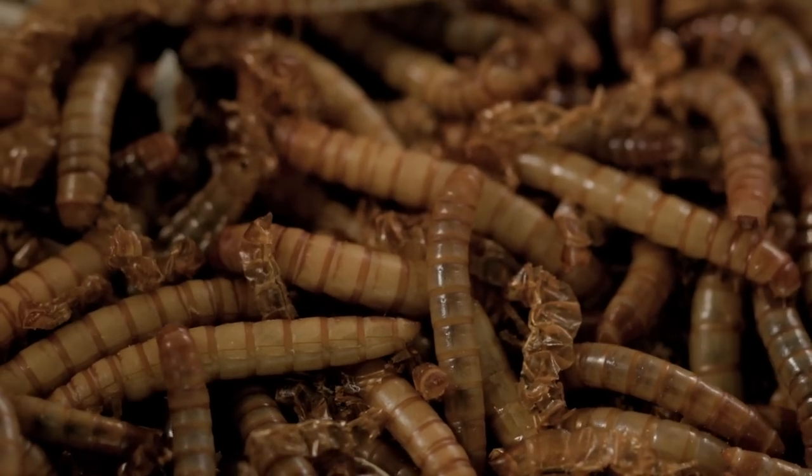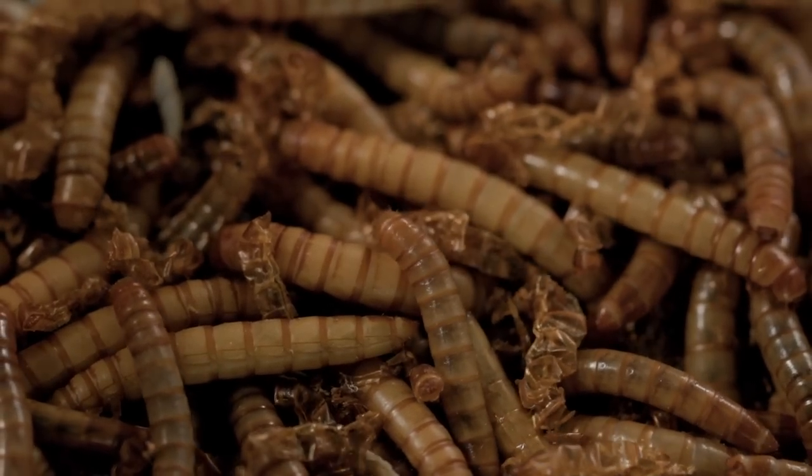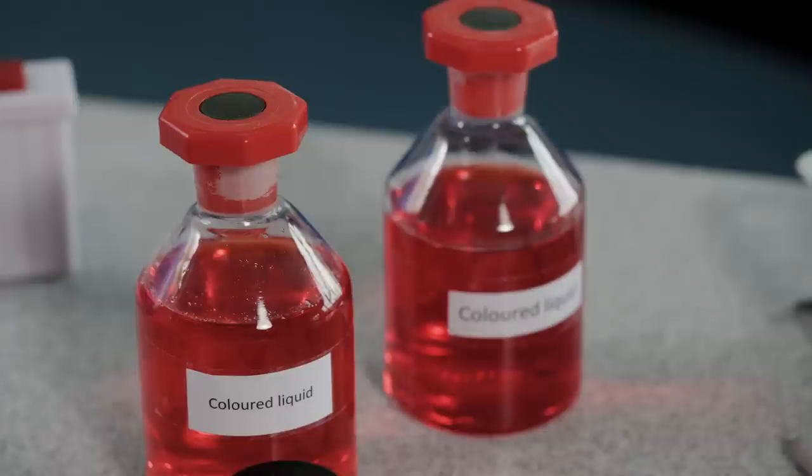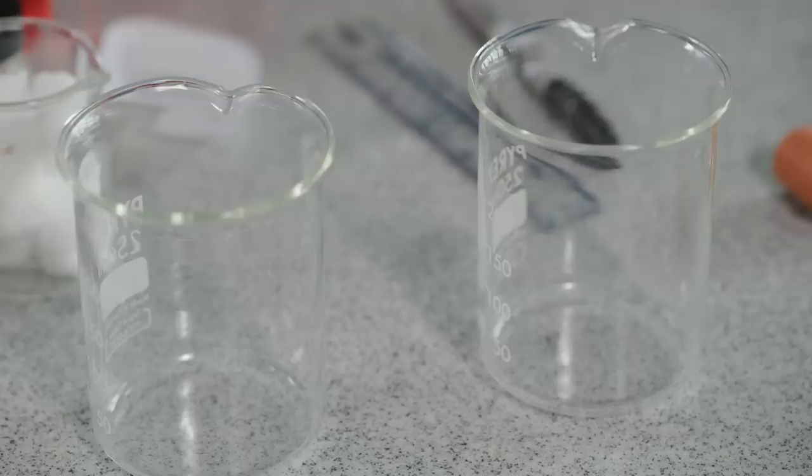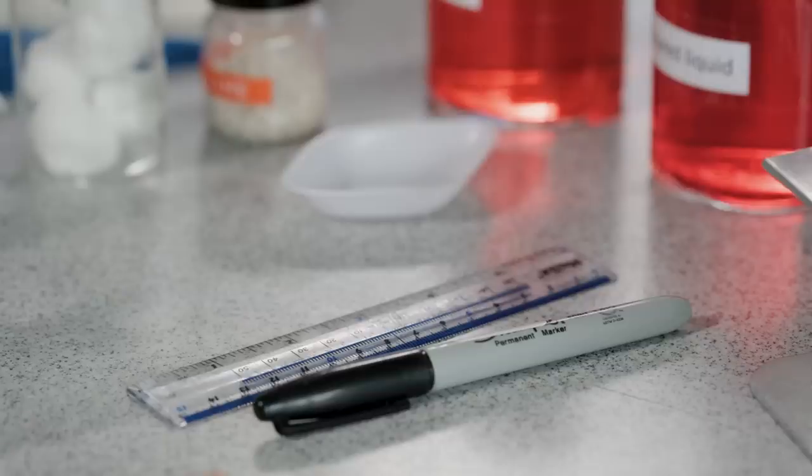Small organisms—we are using maggots—colored liquid, two beakers, forceps, millimeter scale ruler and a marker pen.